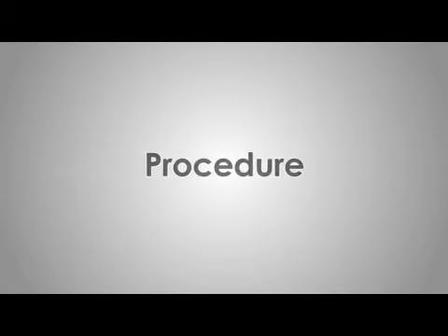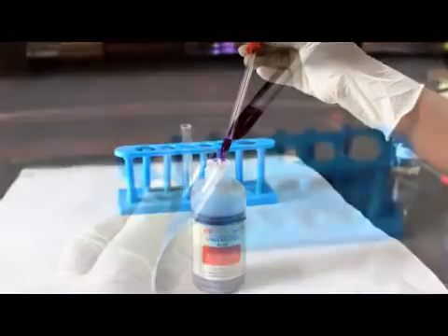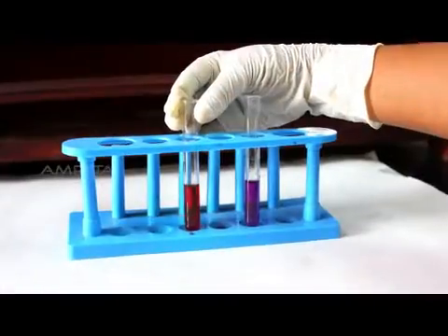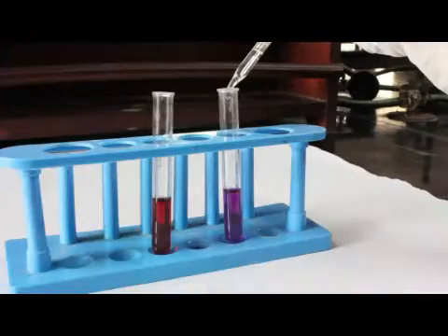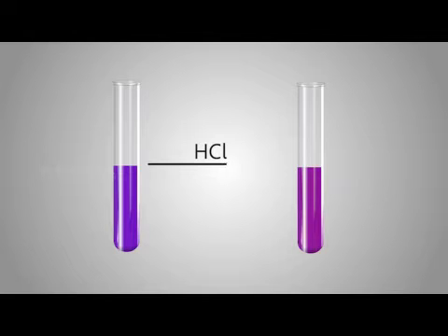Procedure: To study the action of HCl and NaOH on litmus solution, add a few drops of blue litmus solution in one test tube and red litmus solution in another test tube. Place both the test tubes in the test tube stand and add a few drops of HCl in each test tube. You can see that the blue litmus solution changes to red. From this, we can infer that HCl is an acid having a pH value below 7.